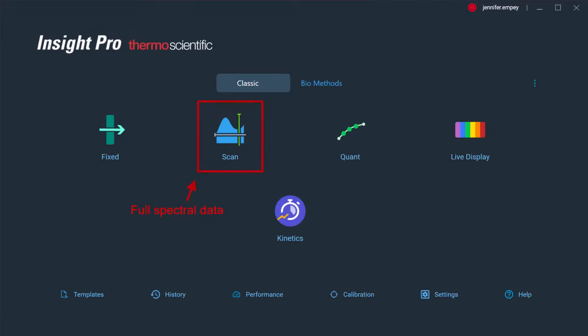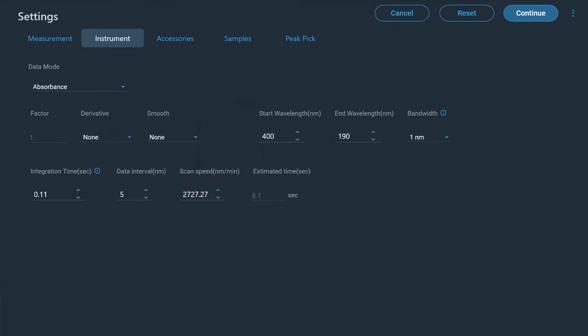The scan application allows the user to specify a wavelength range by which an absorption or reflectance spectrum can be collected. The measurable range for all Evolution instruments is 190 nm to 1100 nm. As with the fixed application, the bandwidth and integration time can be adjusted. In addition, the data interval or scan speed can also be specified.